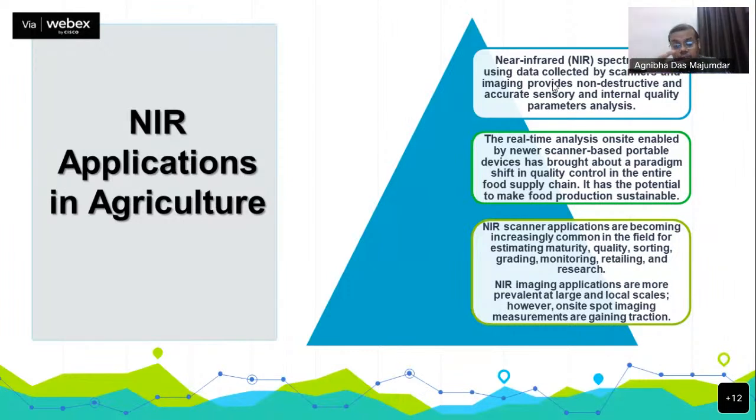That can be possible: the outer quality, the apple is very polished and the looks are very good, but the inner quality is not very good. So with the help of a portable NIR spectrometer, we can have an idea whether the fruit is matured or not, whether the fruit is sweet or not, and whether the fruit is acidic or not. And NIR scanner applications are becoming increasingly common in the field for the estimation of maturity quality.